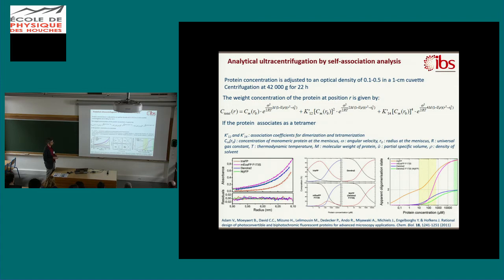But still, in concentrations you find in a crystal, so in a crystal structure, when you want to analyze your protein, you'll find again tetrameric structures. So it doesn't mean that your protein is not monomeric in cells. But still, these ones you may prefer them because they will behave longer on a longer range as monomers.